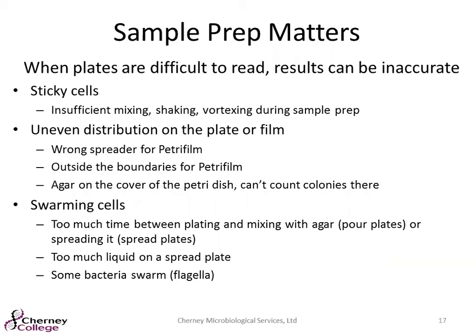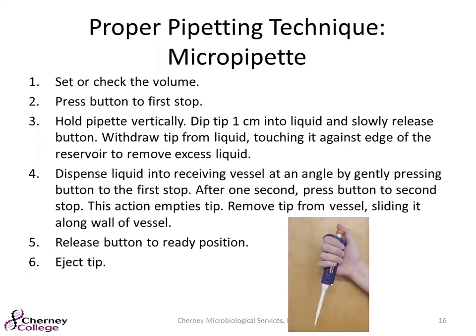So all of those steps, and I actually want to make one more comment about these pipettes. Not all pipette tips are created equally. Over the years, we have changed brands for one reason or another, and not all of them may draw up as quickly. The bottom of the tip can be a different size. So really watching that, and if you change a brand or whatever it may be, making sure that technicians really know, because sometimes you do have to draw it up a little bit slower or wait those like 2 seconds for the rest of the liquid to come up. So really just making sure that you understand the kind of tips you're using and how they work.